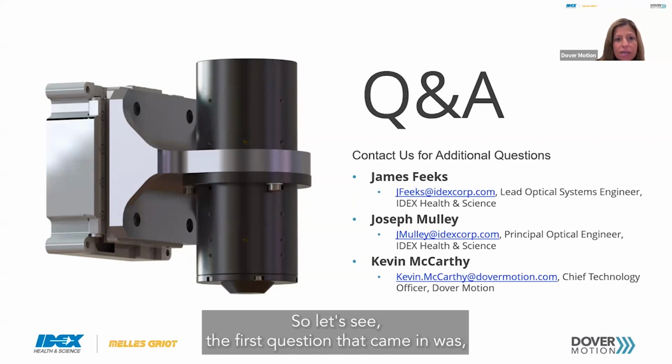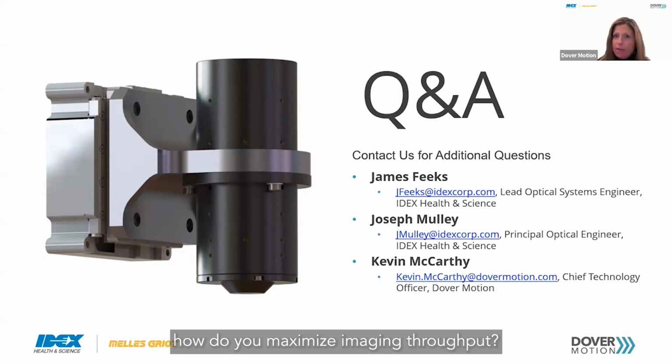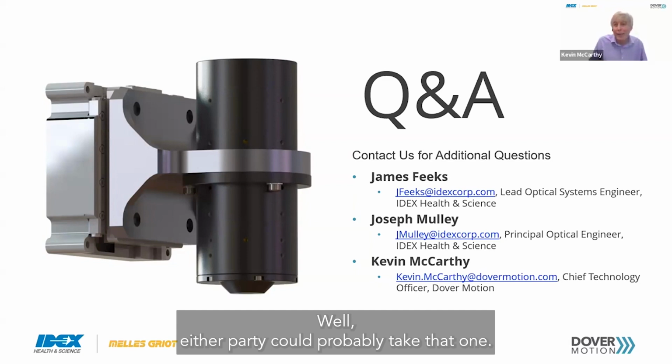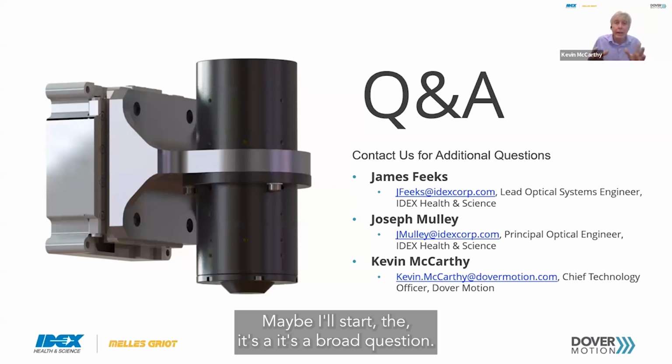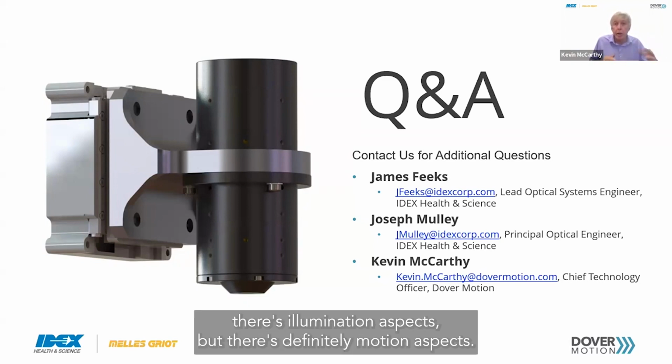The first question that came in was, how do you maximize imaging throughput? Either party could probably take that one. Maybe I'll start. It's a broad question, and certainly there are optical aspects, there's illumination aspects, but there's definitely motion aspects.